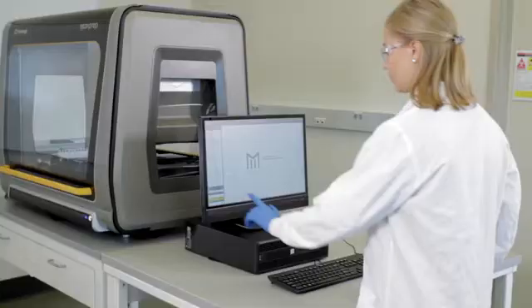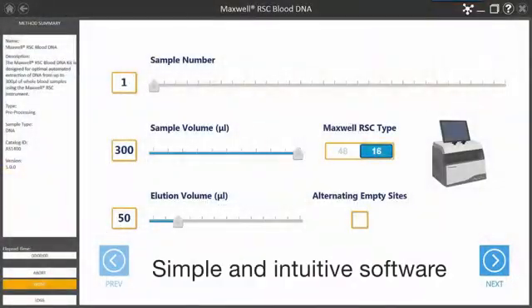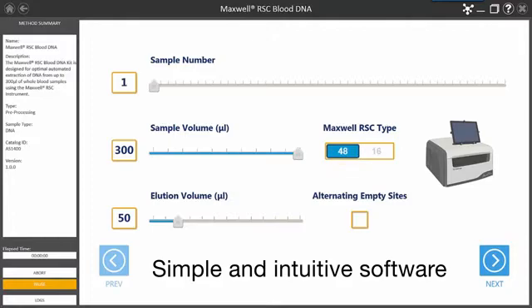The MaxPrep software is designed to be used by anyone in the lab. The software interface guides users through setup of the liquid handler in minutes.